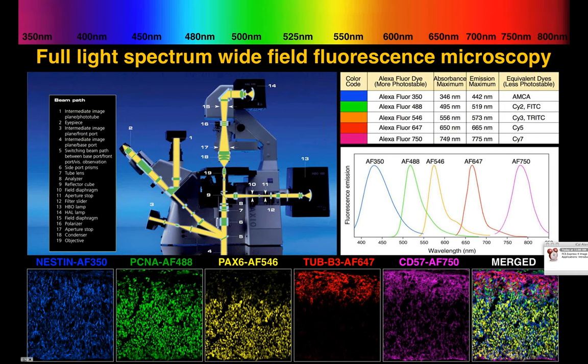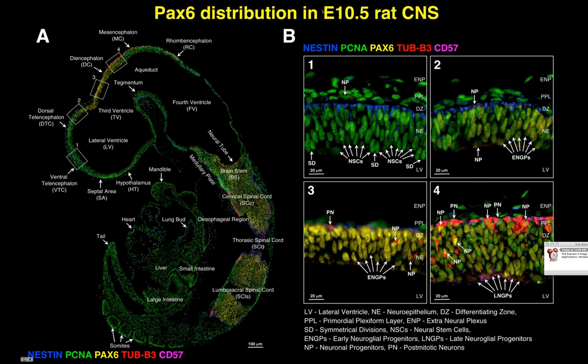However, you can see how complicated and how many different organizations of cells there are within the tissue, and how to get access to and quantify this is obviously a challenge. So in order to address this question, we also have to be aware of the anatomical gradients, what happens when.